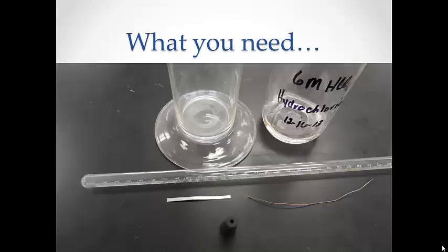For this procedure, you need a large graduated cylinder, a gas measuring tube, a length of magnesium, a length of copper wire, a one-hole stopper that will fit in the gas measuring tube, distilled water, and 6 molar hydrochloric acid.